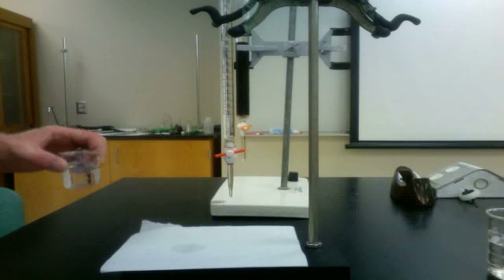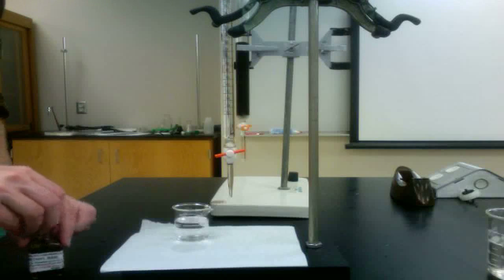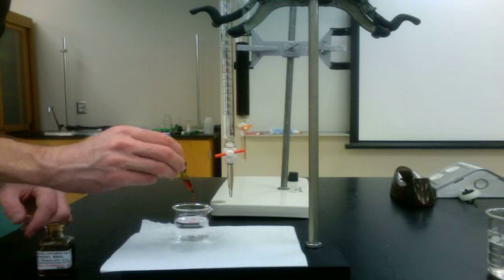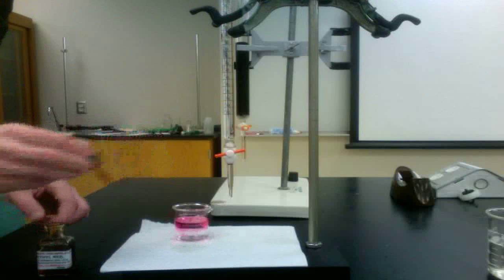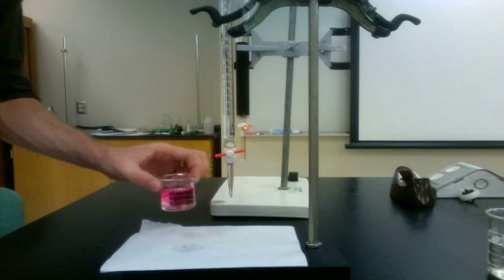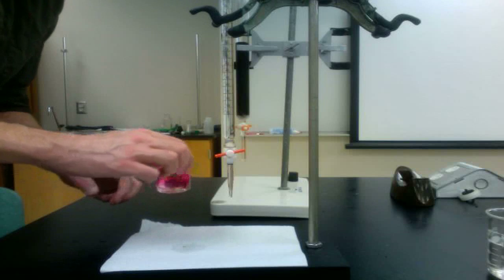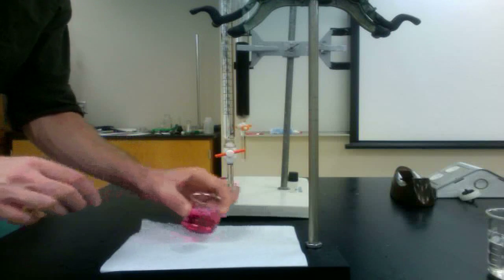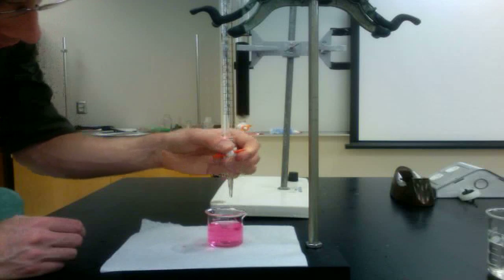Once again, the effluent will need to be tested to see if all the acid has been collected. To do this, a volume of effluent is collected and a drop of methyl red indicator is added to it. If a drop of base does not change the color of the solution, more acid remains on the column. It is crucial to both record the volume of base as well as keep all the acid that has been collected in these fractions.